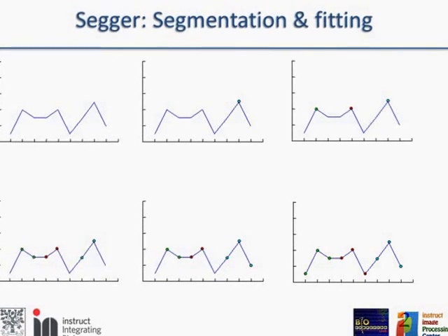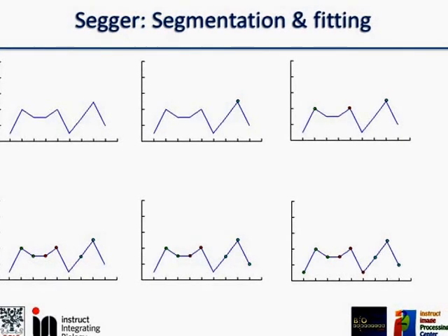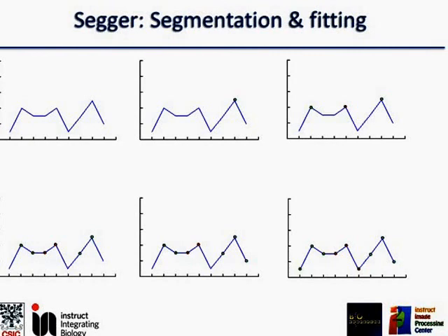Okay, so let's go to one dimension instead of three dimensions. Imagine that these are now my voxels, and this is the density function of my map. What Segger is doing is sorting all the density values from the highest to the lowest. I select the highest value, and this point defines my first region.